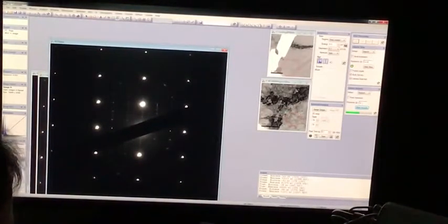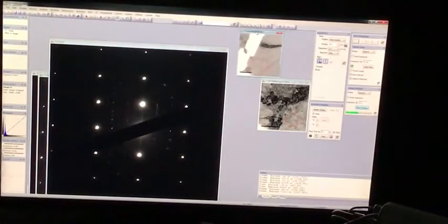So that's the area of interest right there, which I'm going to put another circle for you. It comes from this area here. So this region here, maybe we'll make these different colors. So what we'll do is, this is an idea.